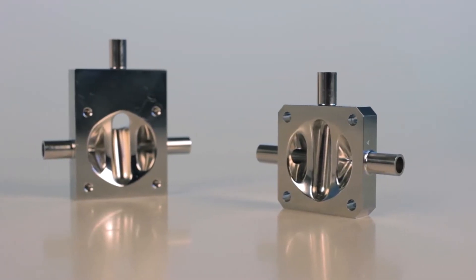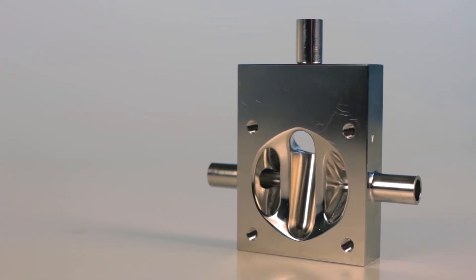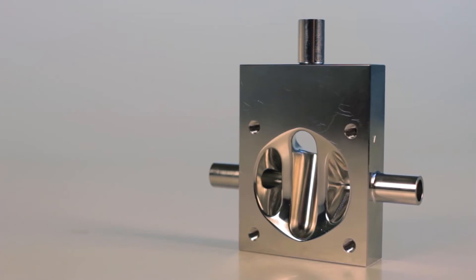We've taken the conventional diaphragm valve, made changes and developments to it, and produced a valve solution which is much more compact, reduces internal volume and waste, reduces energy consumption, and is a much better fit for a modern hygienic pharmaceutical or biotechnology processing plant.